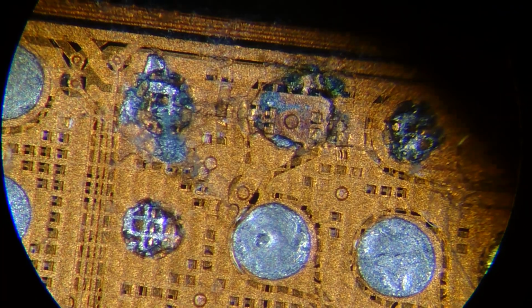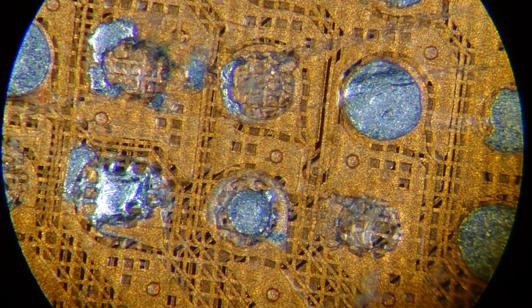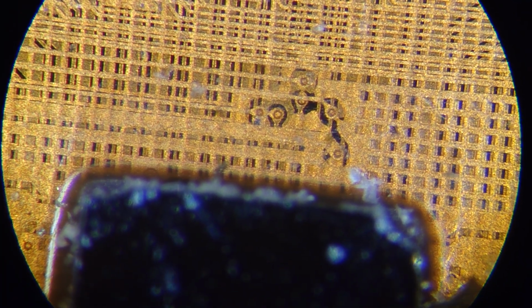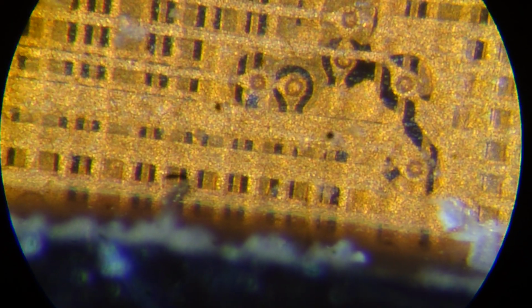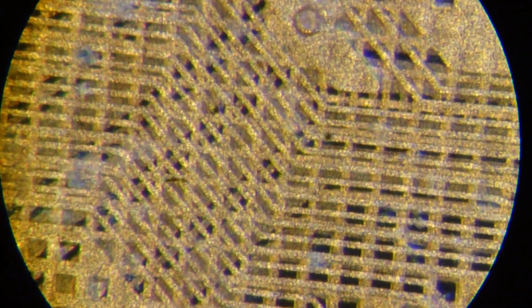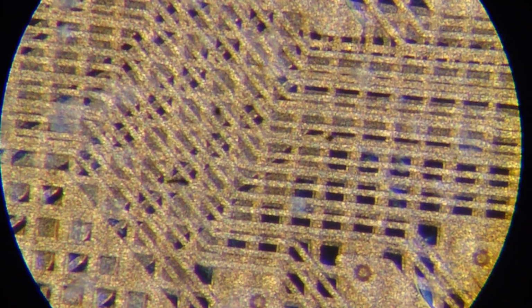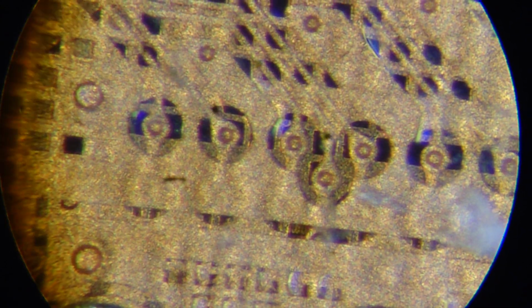Okay, let's move backward a bit. Let's find something interesting. I will zoom back to that place. What might be interesting here might be... Oh, I remember this place too, so let's zoom in and see what we got in here. To be frank, I don't see anything interesting, but at least you can see over those conductors, and maybe those conductors would give you some hint about the real resolution of the microscope. And this part definitely requires our refocusing to see at least both layers here.